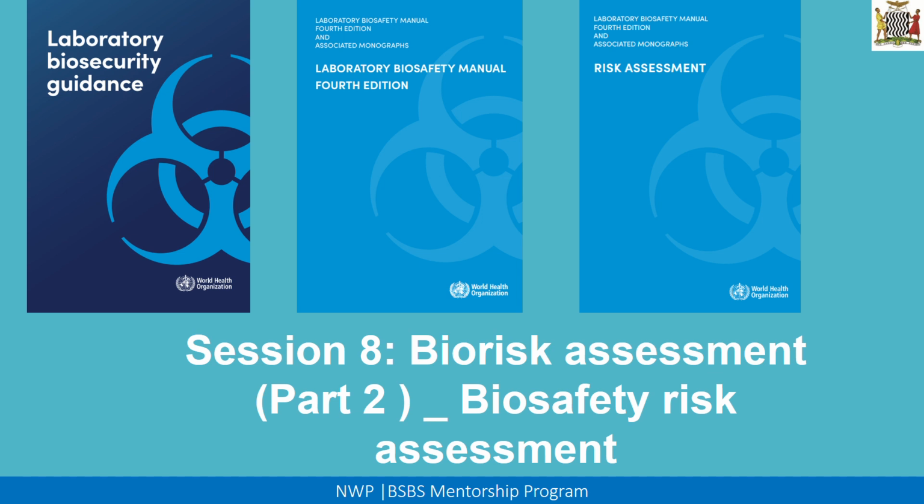For today's session, we'll mostly look at biosafety risk assessment. Like we introduced biorisk in the previous session, we simply introduced it as being a combination of both safety and security risks. But for this session, we'll mostly just look at the biosafety risk assessment. We're going to look in a little more detail at what actually contributes to the risk.